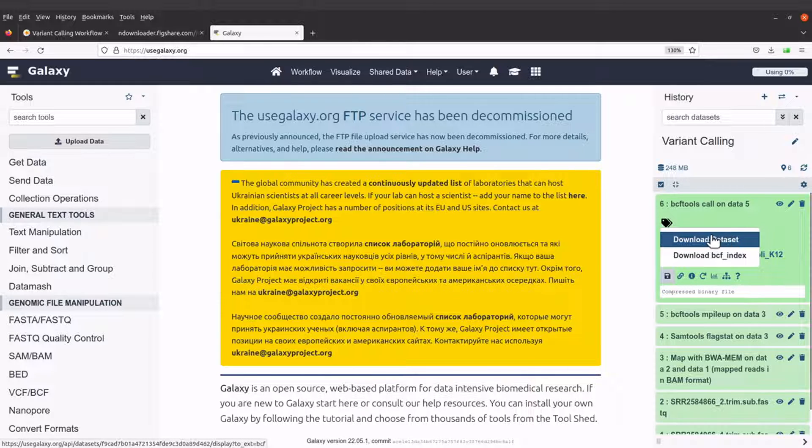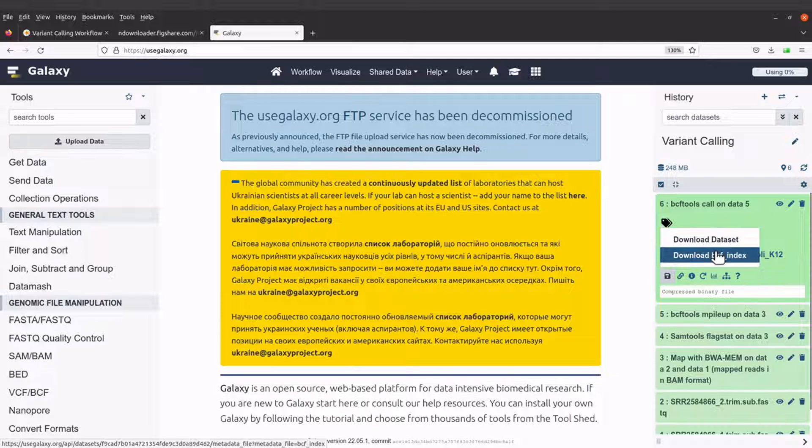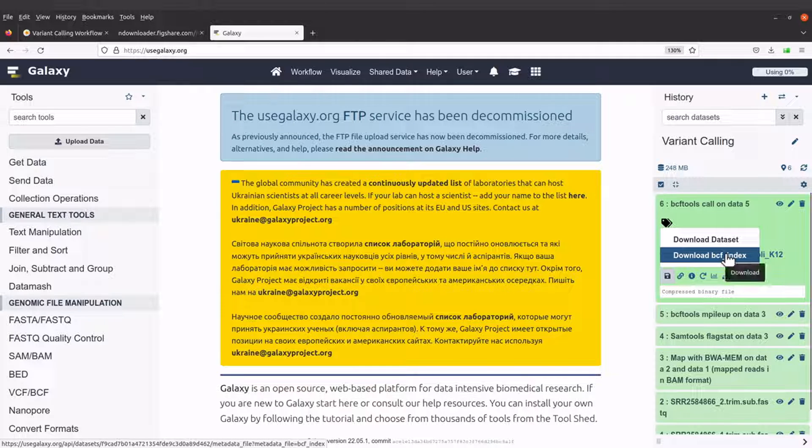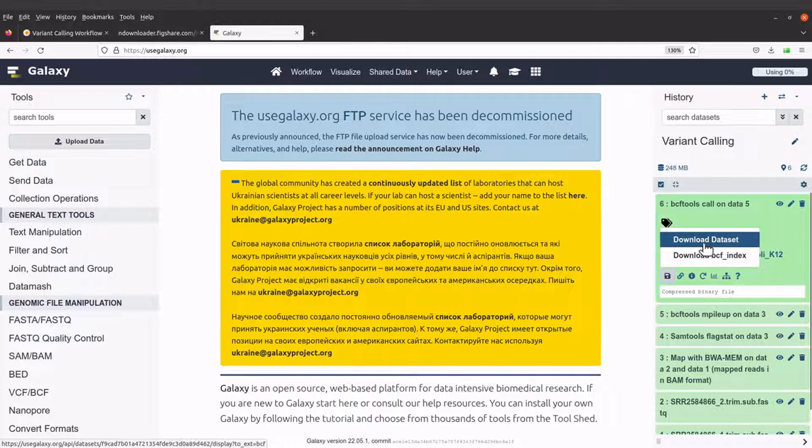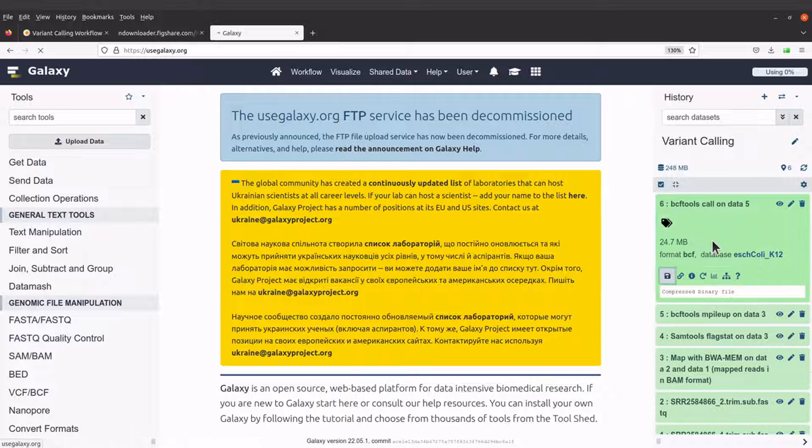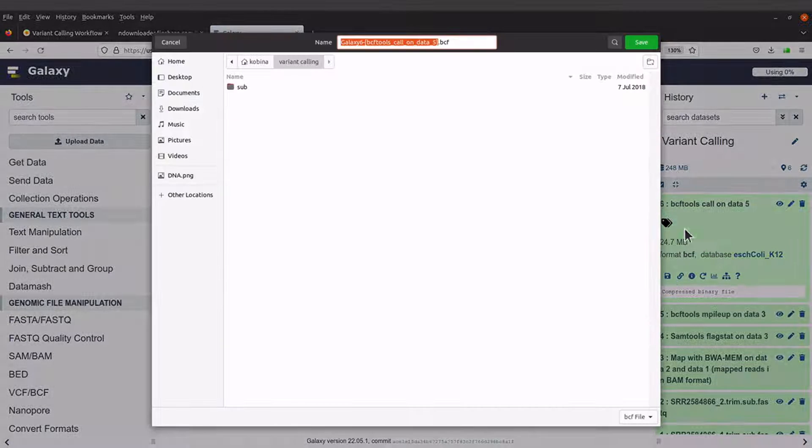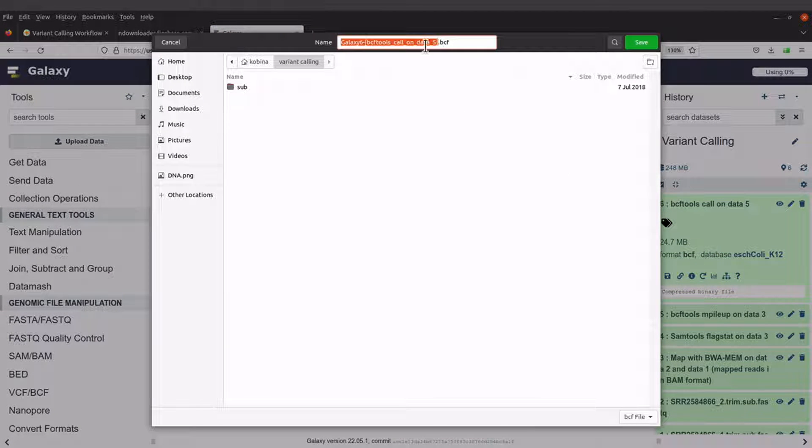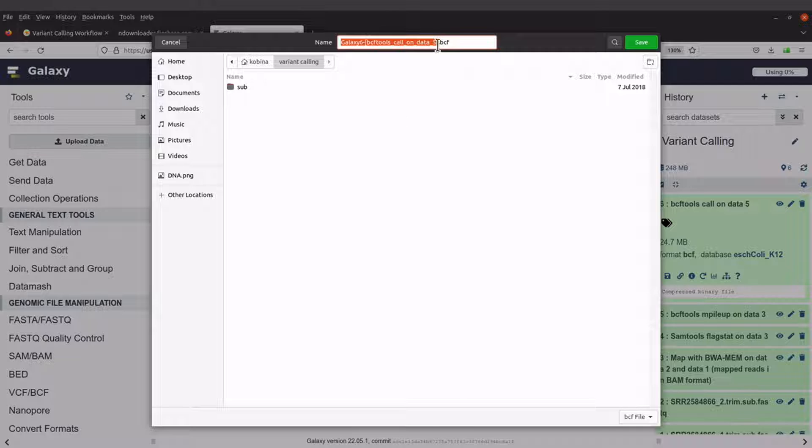So we will start with the dataset. So click on download dataset. Then let's download it.